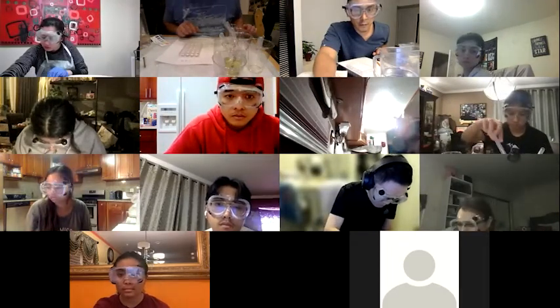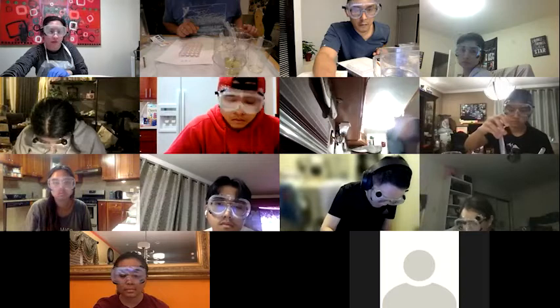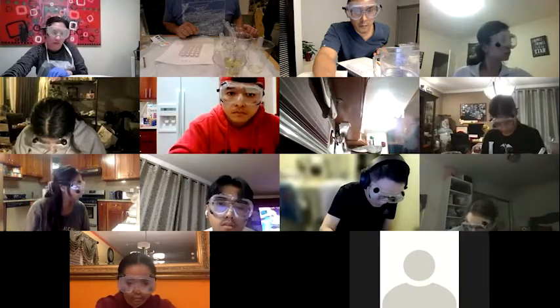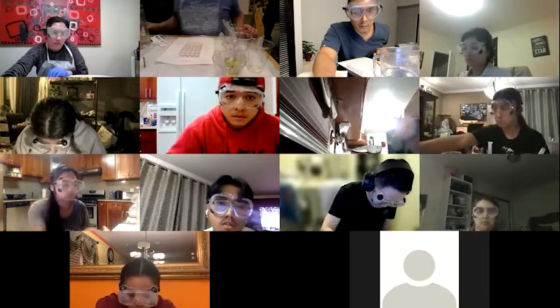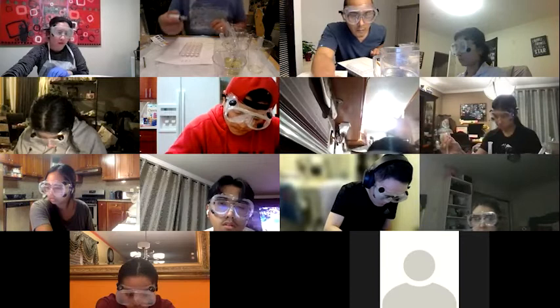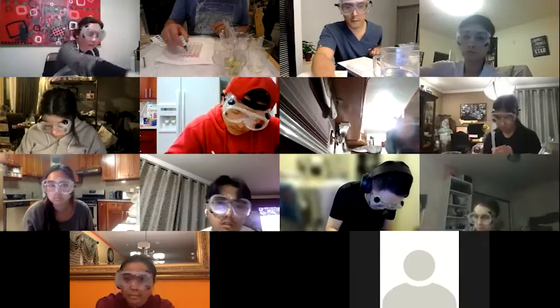Professor? Yeah. Do you still want us to add 1 drop of the indicator to each well? You can if you want. Yeah, I think that was more of a thing for the second part, but yeah, feel free. Yeah, in fact, why don't we? It'll make it, oh yeah, definitely brightens up the colors big time.